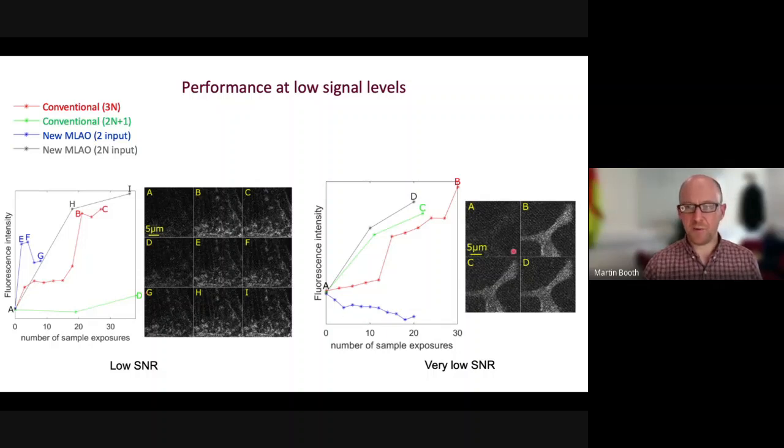It's interesting in this one, we've got really low signal levels here. It's so low that if you look carefully, you can see a lot of just interference, electrical interference noise on the image. But even so, one of the machine learned ones worked really well. The other one doesn't. Now, the one which doesn't work well is the one where we only took two images. And there's actually very good explanations why we'd expect that one to fail here. But the other method, with taking more images, still outperforms the conventional one. So, on all of these demonstrations, we've seen that we can actually get a system now which outperforms our conventional algorithms.